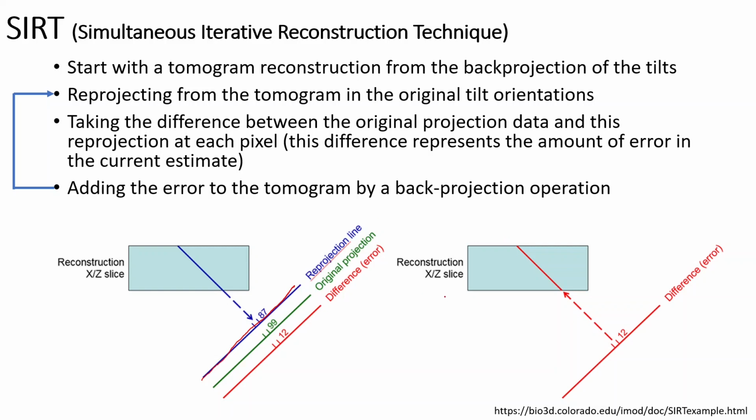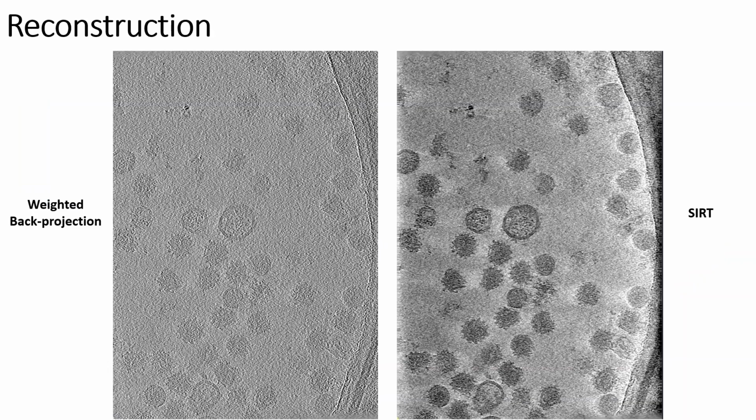We do this not from a single tilt angle, but from all the tilt angles. This makes it a little bit more time consuming, yet it will give us nicer reconstructions. What we need to do is find the correct number of iterations that will lead to nice reconstructions, yet won't waste too much time.